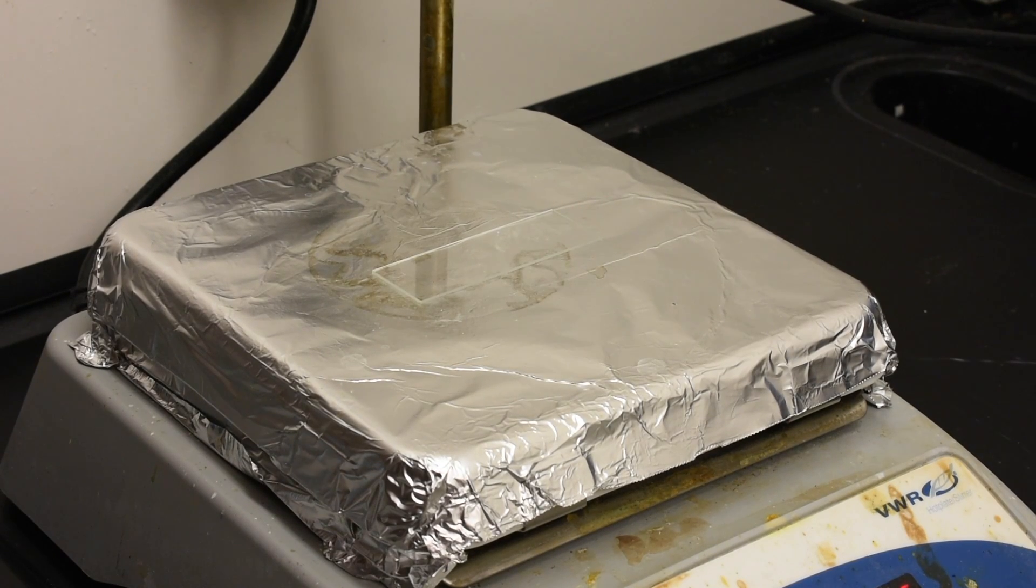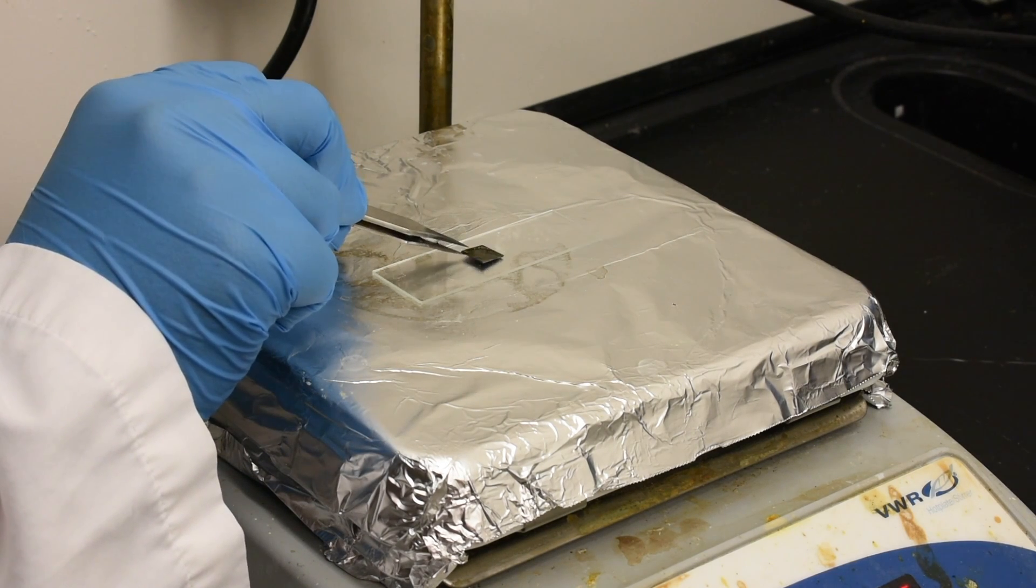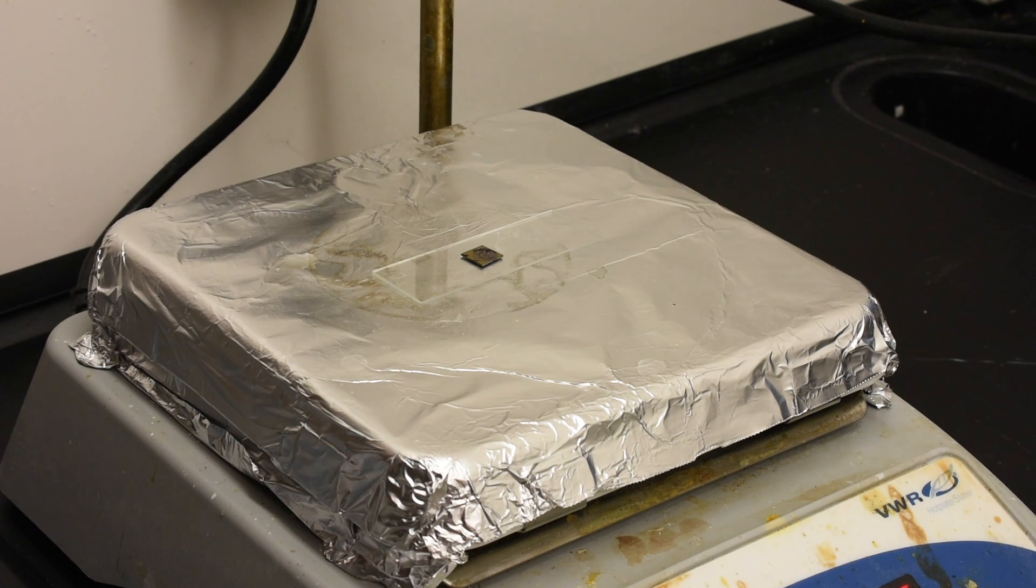The PMMA and thin film on a silicon substrate is then placed on a hot plate for 10 minutes at 50 degrees C, followed by 10 minutes at 70 degrees C.